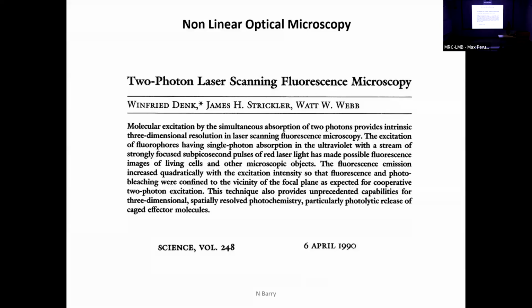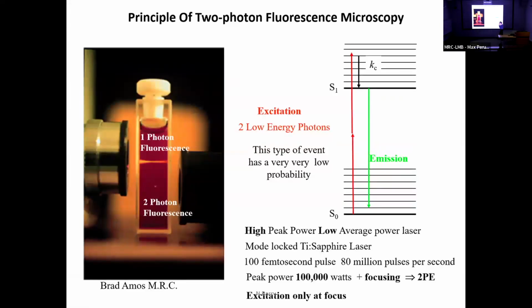So you can see light going through your hand if you stick a torch on it, but you just can't image any detail. So how do you get rid of that problem? And this is what's going on. Rather than using one photon to excite fluorescence, in a typical confocal microscope scenario, you can see the light coming down to the focal plane and then going out of focus afterwards. Here you see this big cone of out of focus fluorescence, but also in tissue there would be a big haze of scatter as well.